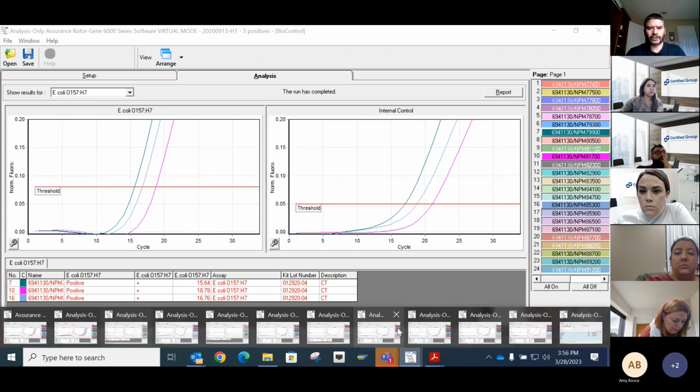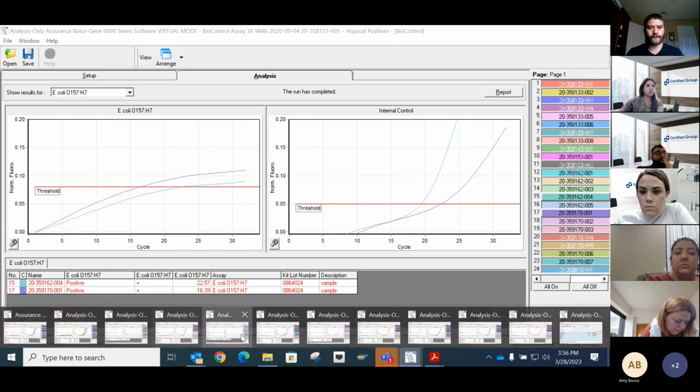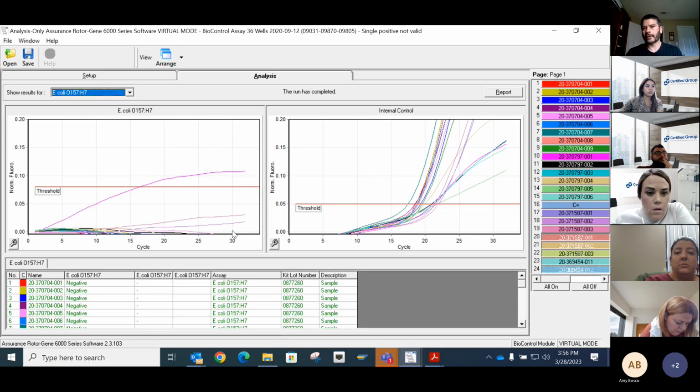But those invalid results, they start up at around, this one started once again about 2. It took 18 cycles for that to hit the threshold. Not DNA amplification, right? Not that exponential growth. Here's another example, just moving along at an angle. Not the typical DNA amplification.